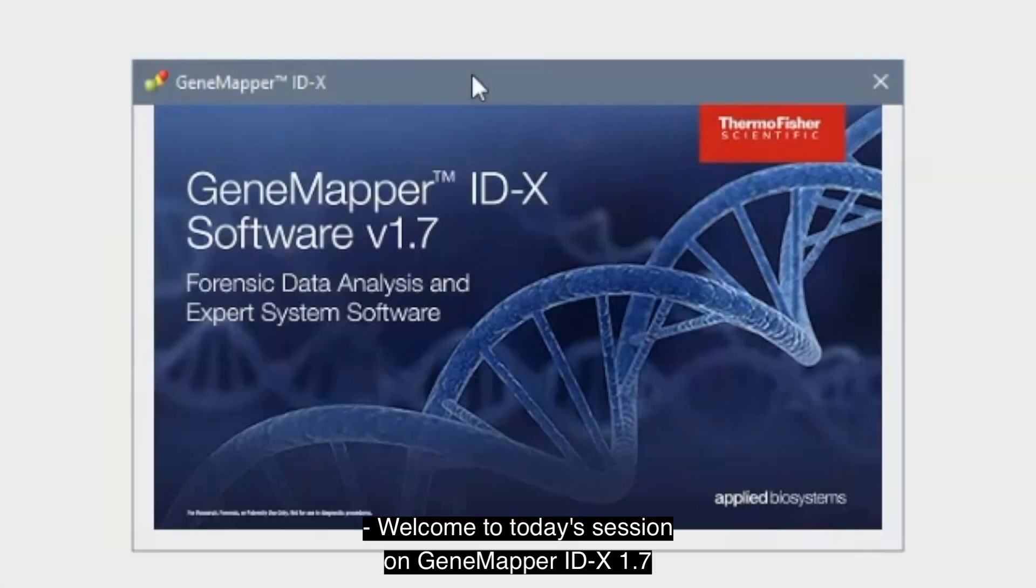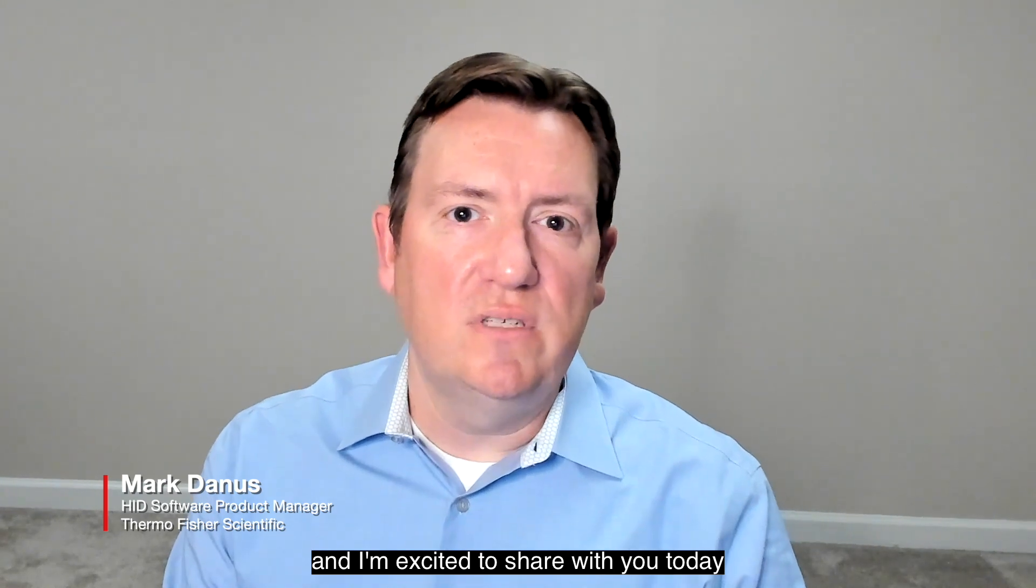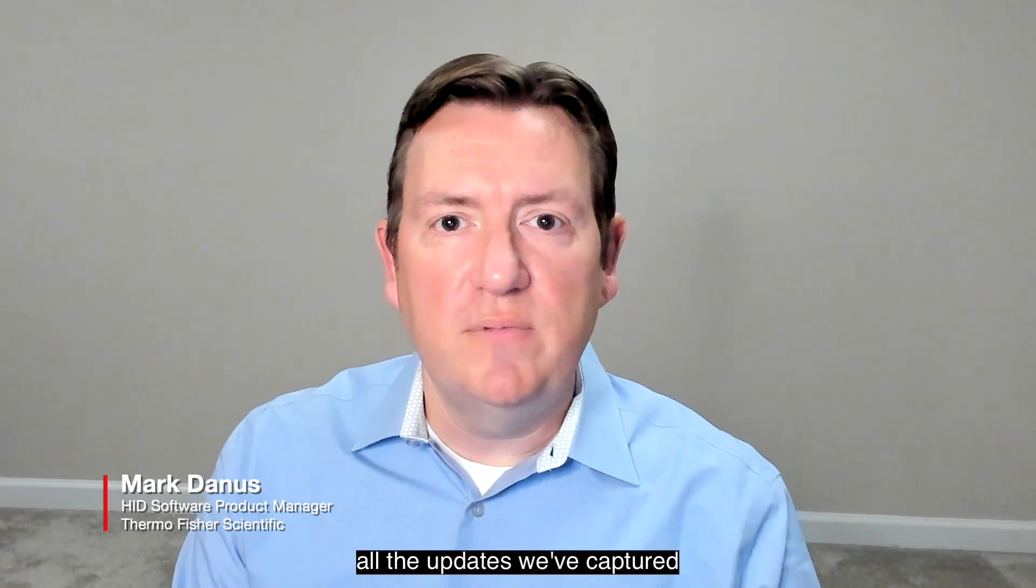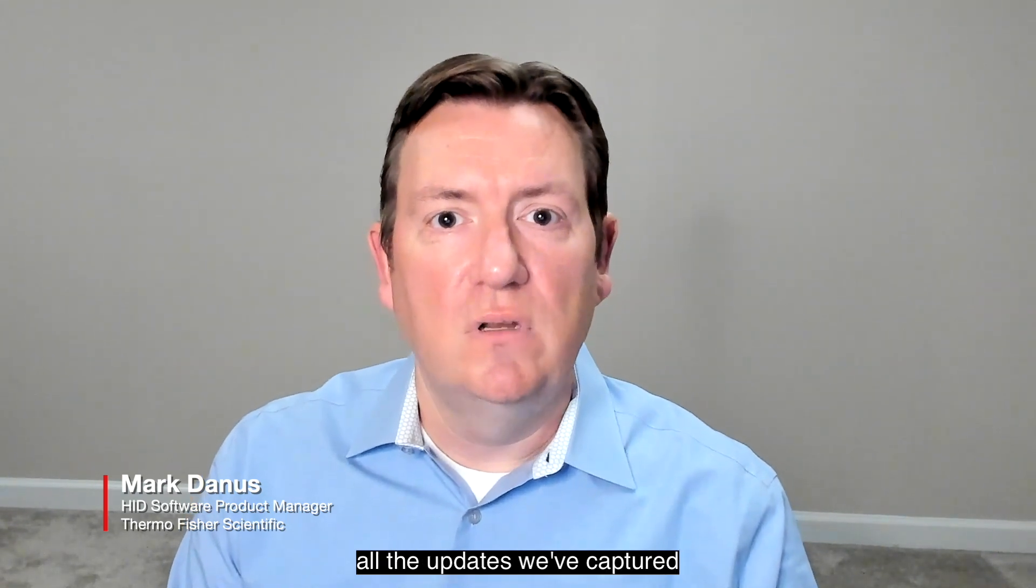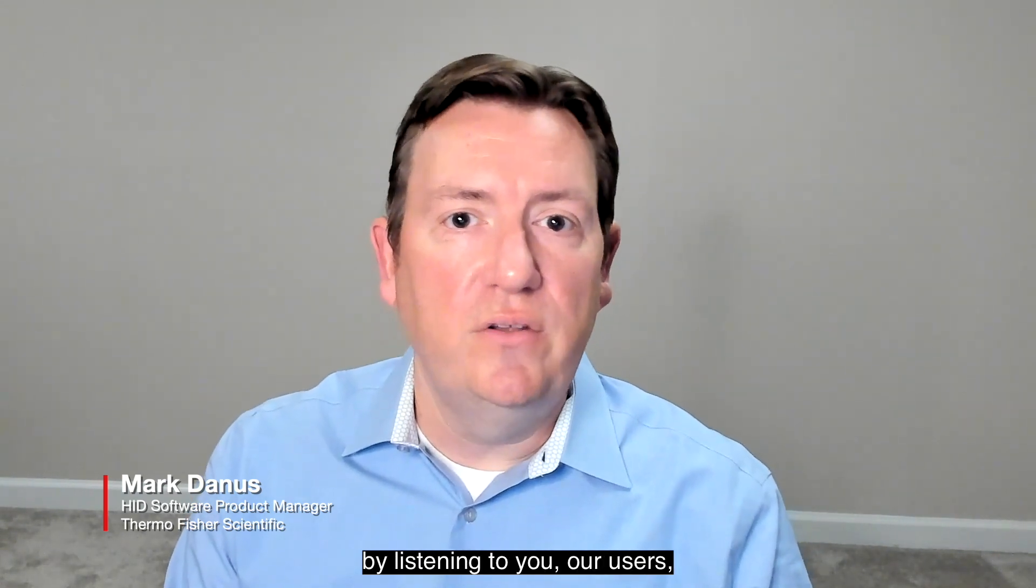Welcome to today's session on GeneMapper IDX 1.7. I'm Mark Danis, HID Software Product Manager, and I'm excited to share with you today all the updates we've captured by listening to you, our users, for GeneMapper IDX version 1.7.